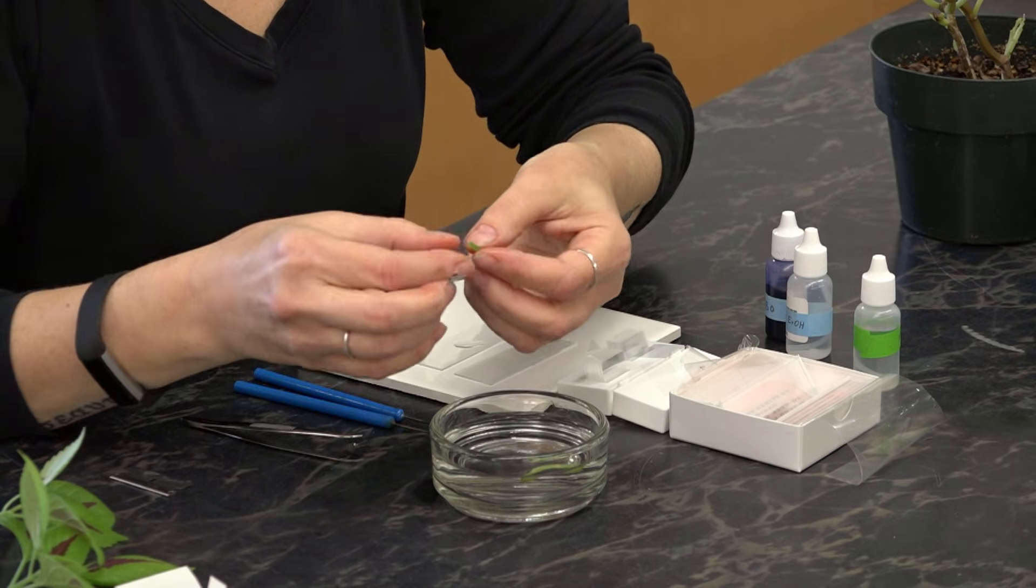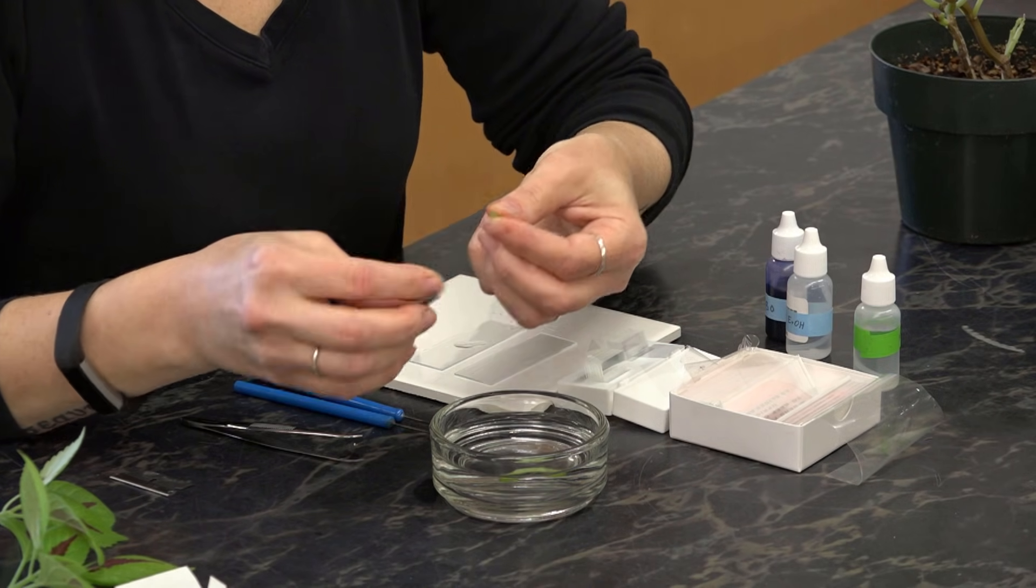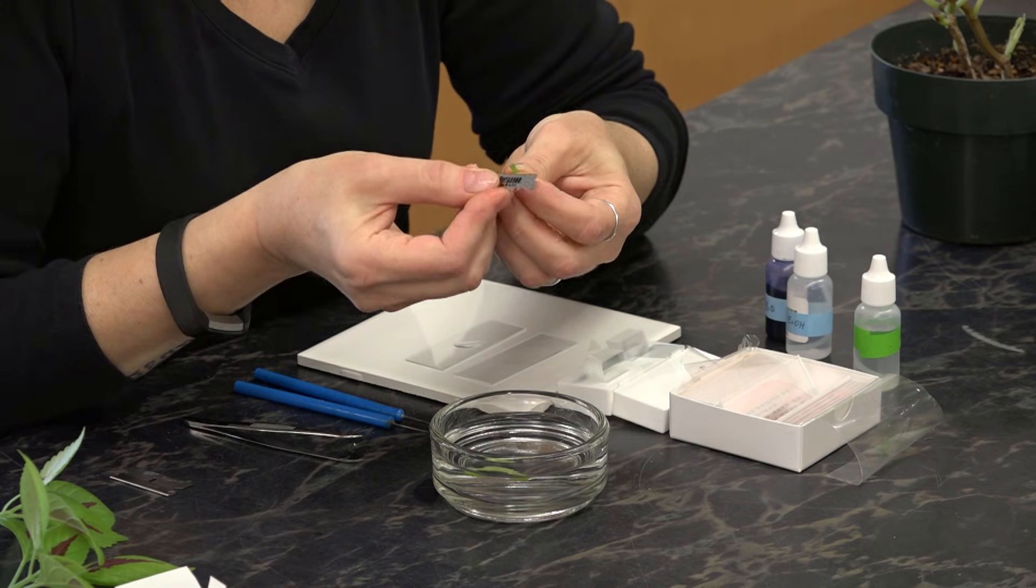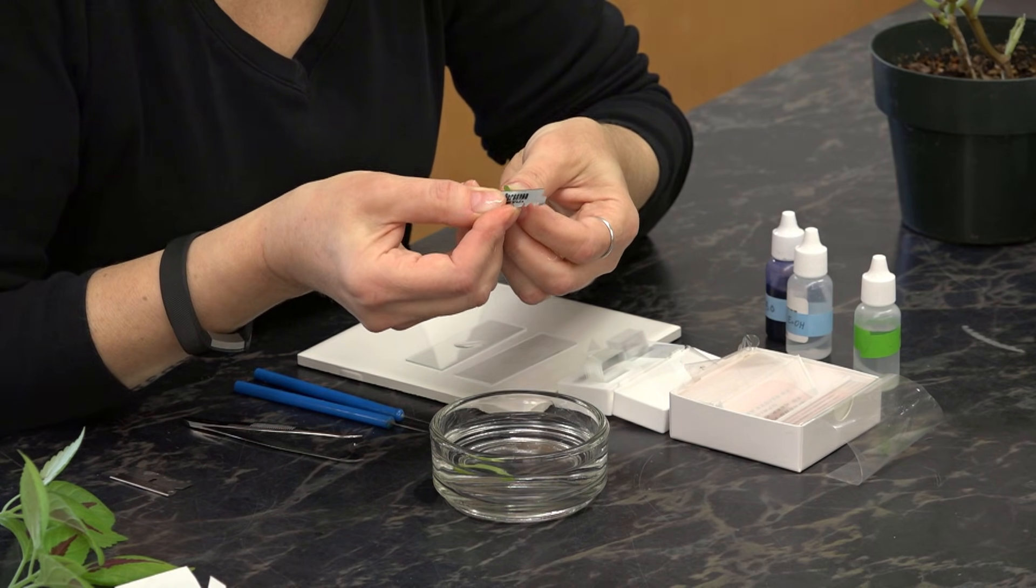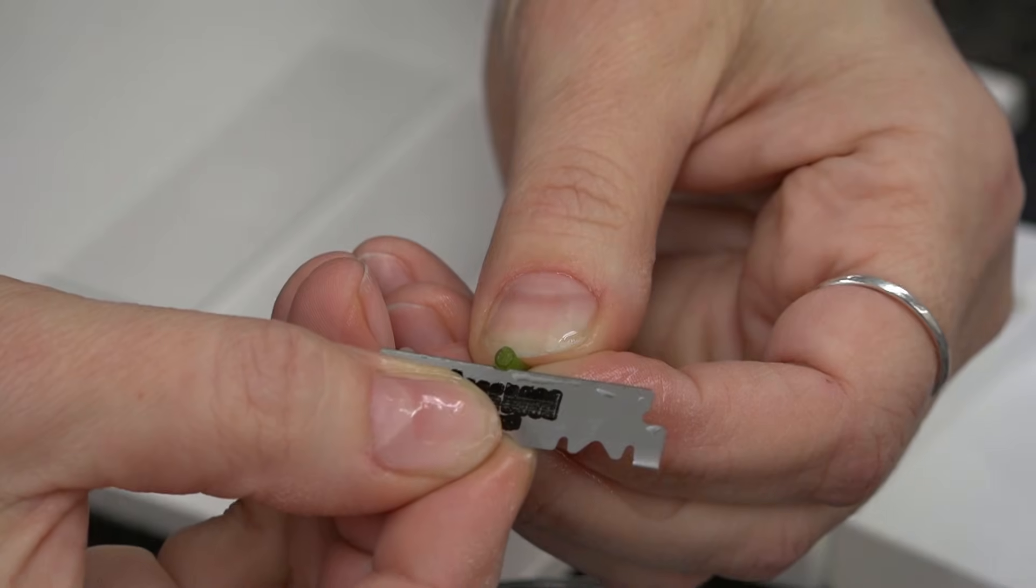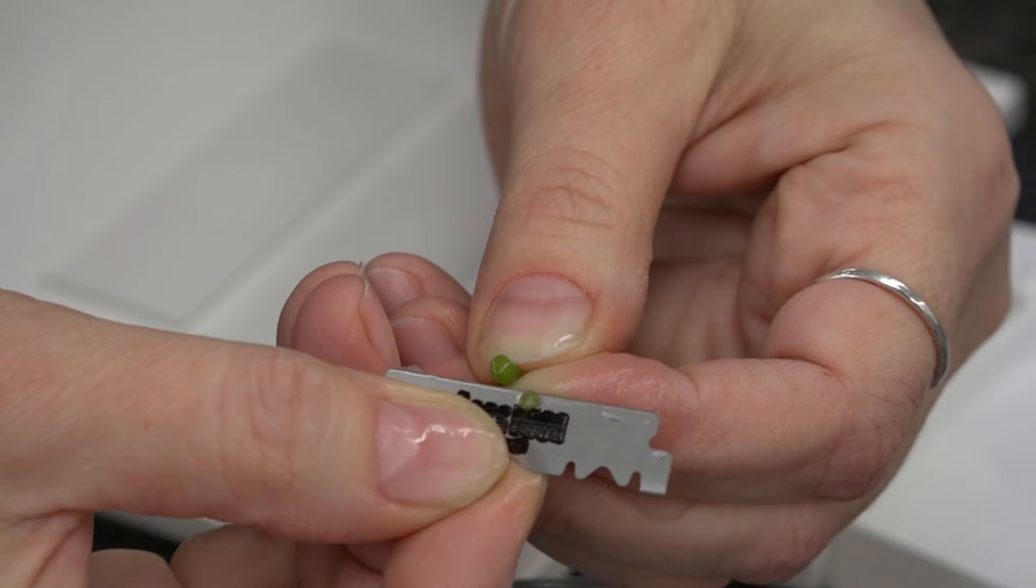Then to make a cross section, hold your material firmly in your hand and draw the blade towards you, trying to make the section as thin as you can.